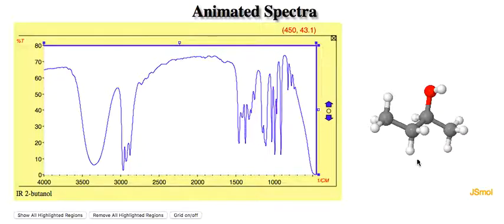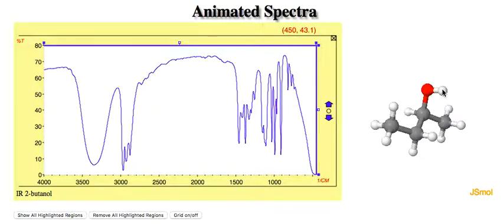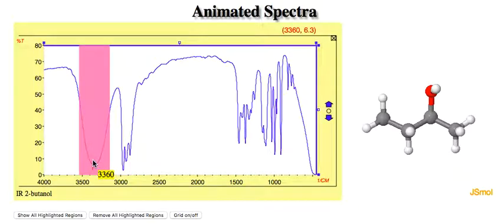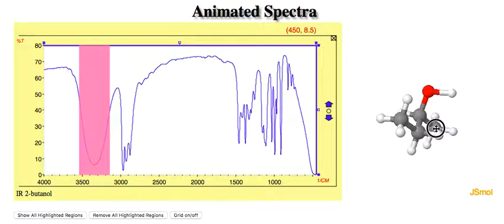And then I have this molecule here, where we have an alcohol group, OH, and there's a very, very prominent feature that goes along with that. And it's not this. These are all the CH stretches, the various CH stretching modes over here. And this thing is the OH stretching mode there. And it's a big broad peak. I'm not sure why it's disappearing in the animation, but the reason it's so broad is because in a solvent, this can hydrogen bond, which means that not every single OH is in exactly the same environment. They could be closer to the next molecule in the liquid, they could be further from the next molecule, and that'll spread out the peak.